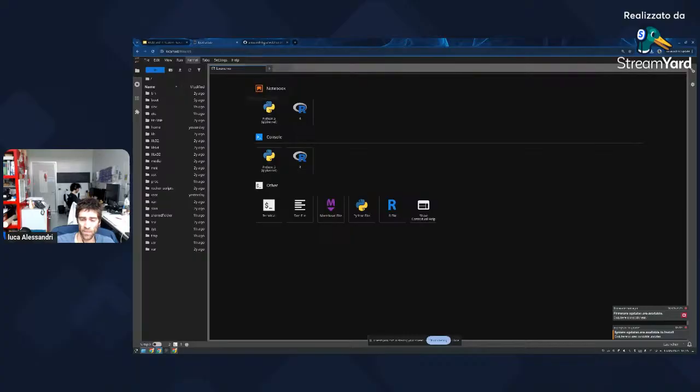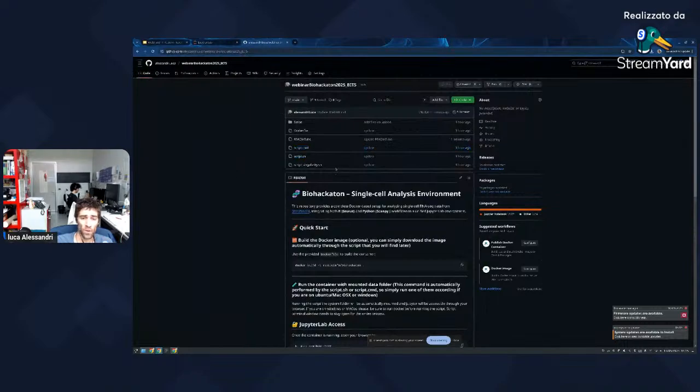We will see Jupyter Lab later, but I already showed you what a Jupyter Lab is in the very first webinar. Instead, for those who want to use Singularity, you can run the Jupyter Lab through this script from Singularity. And you have two options. If you have Windows, you can run it with CMD. And if you have Linux or Mac, you can run it through this script. And of course, for Singularity, you can only run it with Linux and Mac.